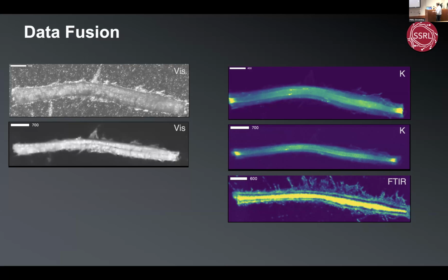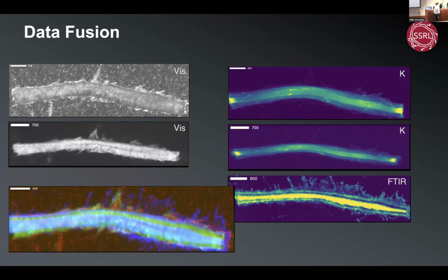But we can put this all into the defining all the points around the edge of the stem and put it all together. And it still works pretty well. You definitely have better hyphae in the infrared, but we get the stem to match pretty well. Now, there is a little bit of a change of the angle over here, so it doesn't do the best overlay on the far left side. But even for something that's kind of been tweaked a little bit, we actually get a pretty good overlay.